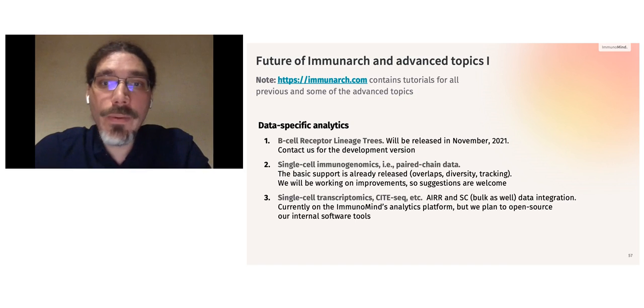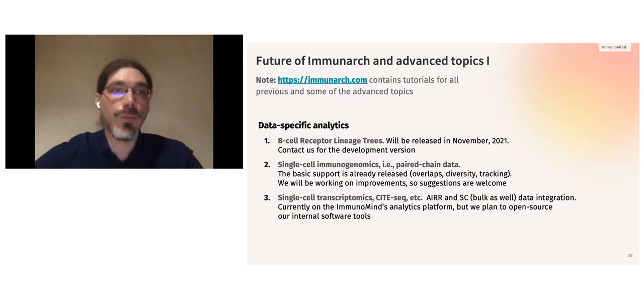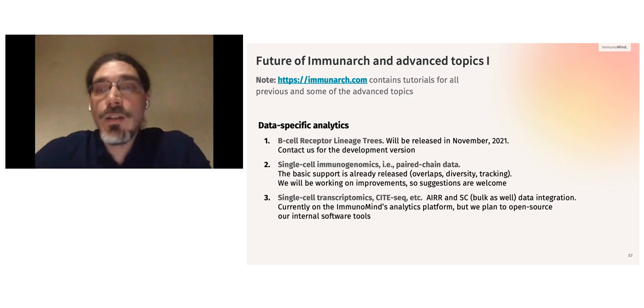We are on the very last slides here, so probably it will be better to answer your questions about tracking annotations if you have any. And I will go to my last slides to talk about advanced topics and future of Immunarch.